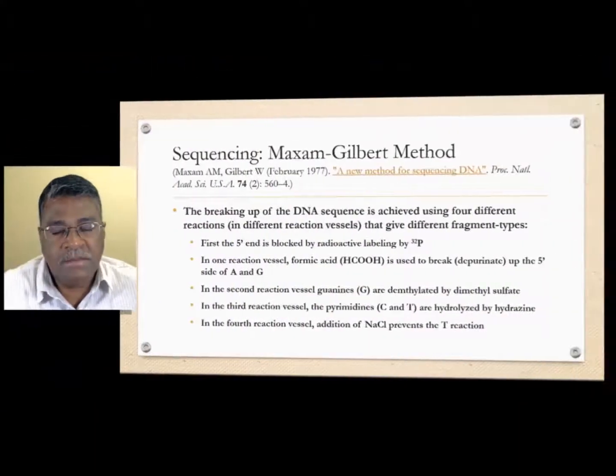through next generation sequencing. But next generation sequencing is quite expensive, and not everybody has those resources. So most labs use what is called Sanger sequencing. But before we get to Sanger sequencing, let's begin to look at the Maxam-Gilbert method.